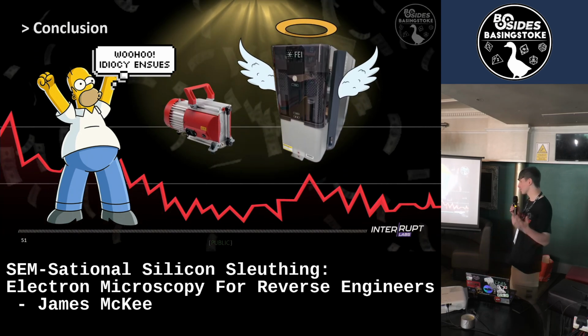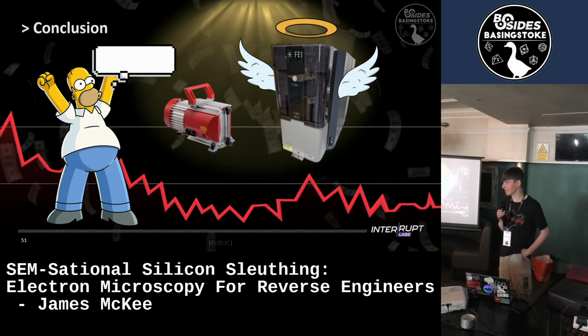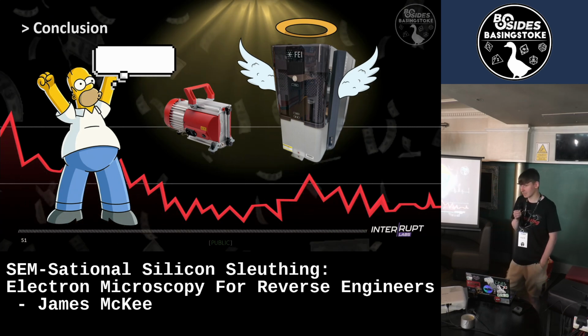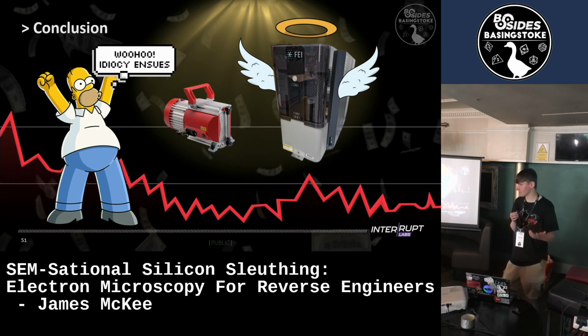Conclusions. Pretty awesome things. If you get your hands on one, it does open up a new world of reverse engineering and vulnerability research. They're not cheap, but do try and get involved. A good way to get your toes in is your local university. You can rent it all out, take some samples in, and they'll teach you how to use it.